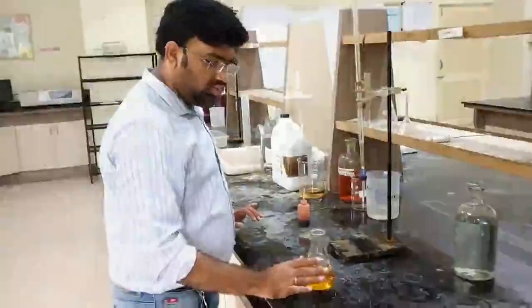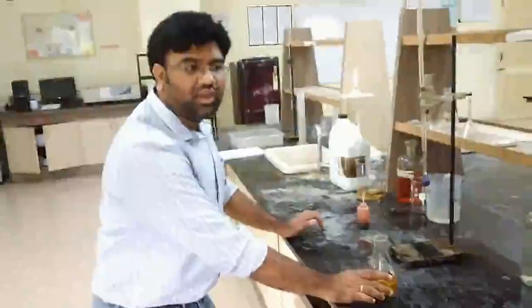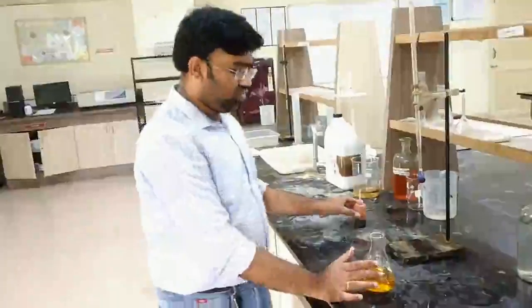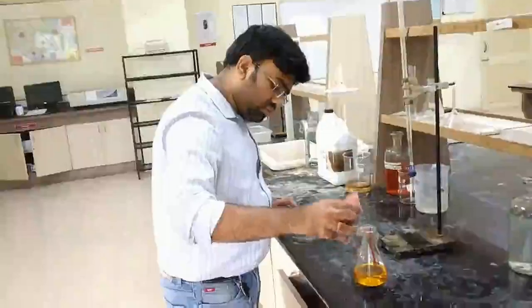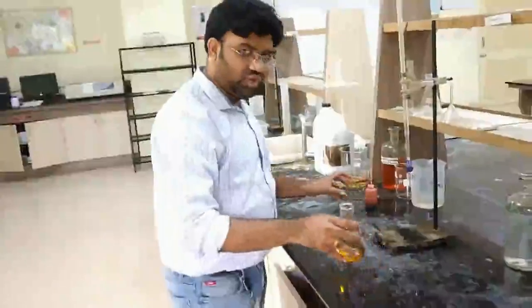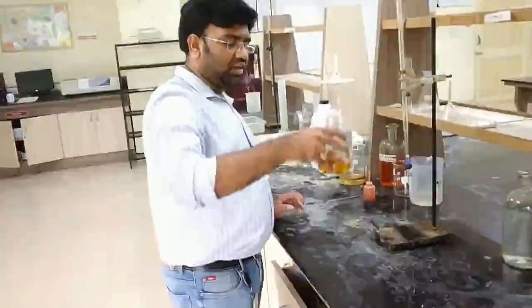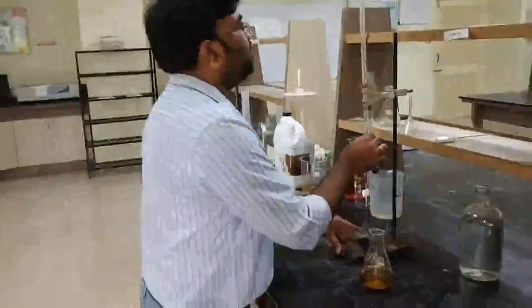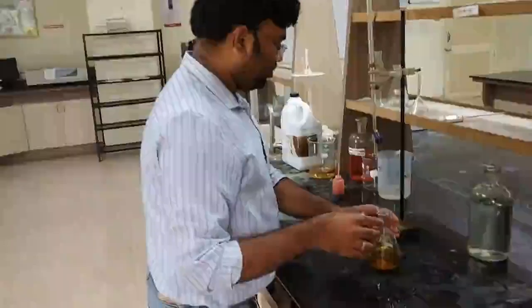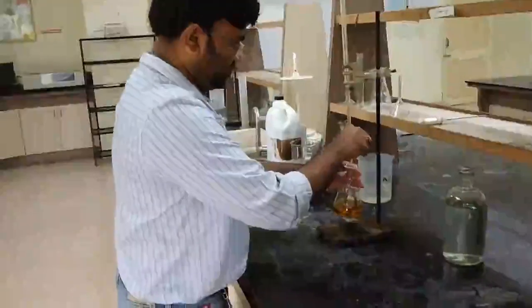We have cooled this sample. Now the next step is to add the ferroin indicator and start with the titration process, right? So 3 to 4 drops are sufficient. We have added this ferroin indicator, and now let's start with the titration. The titrant we have already filled, which is ferrous ammonium sulfate of 0.1 normal.